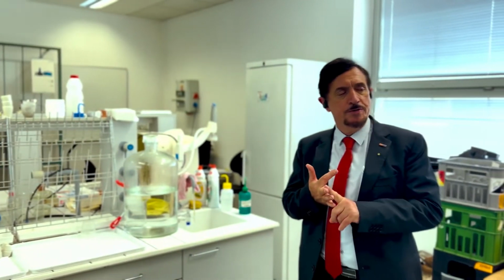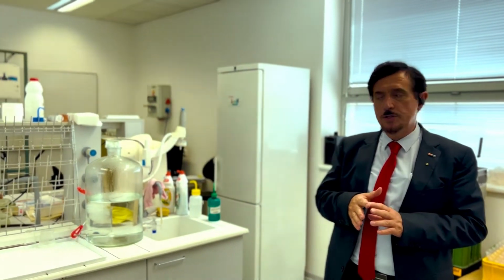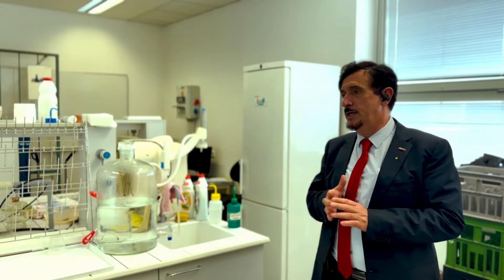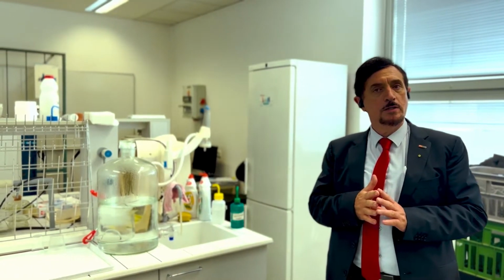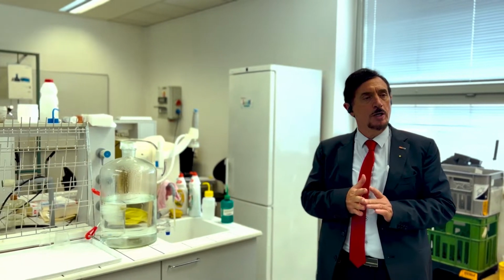I don't know if you measure viscosity. You measure viscosity also because of the distribution in the field, correct? Yes. The viscosity and what else? Chemistry. In physical properties, what do you measure? pH is important. pH. What else? This is chemical. What about physical?